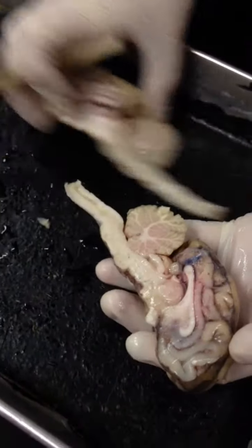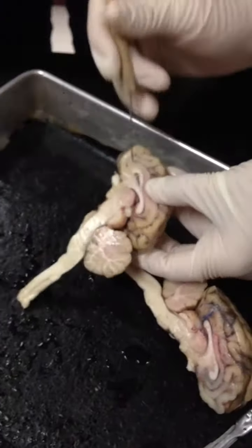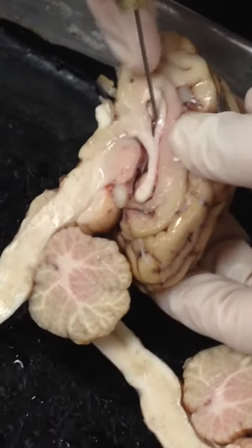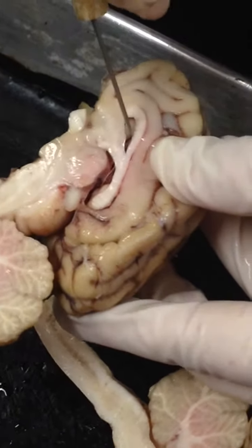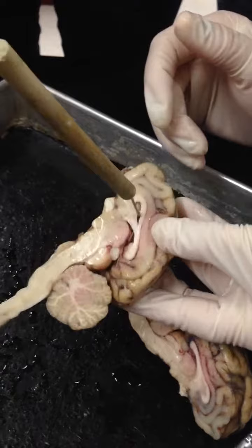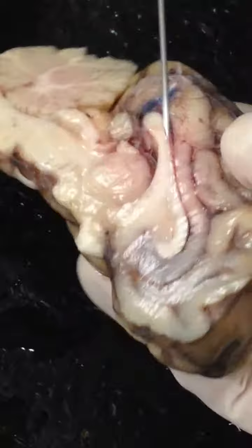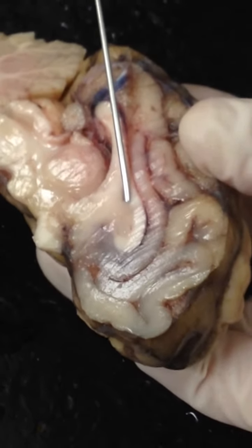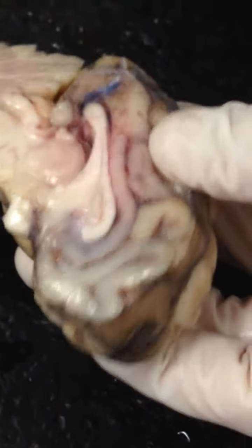Okay, I'll do my best to kind of move this around and show you guys, okay? So remember when we talked about the lateral ventricles? Well, if you look at this side, you can see that there's a space back in here, right? You can clearly see, if I pinch it back, there's space. This is your lateral ventricle back in here. So I could take a pin and put it down in there to ask you about the lateral ventricle, okay? On this side, there's actually a very thin membrane, okay? That's the septum pellucidum that I was talking about. I can just make a hole there, get rid of the septum pellucidum, and we can open it up, and that's the lateral ventricle there.